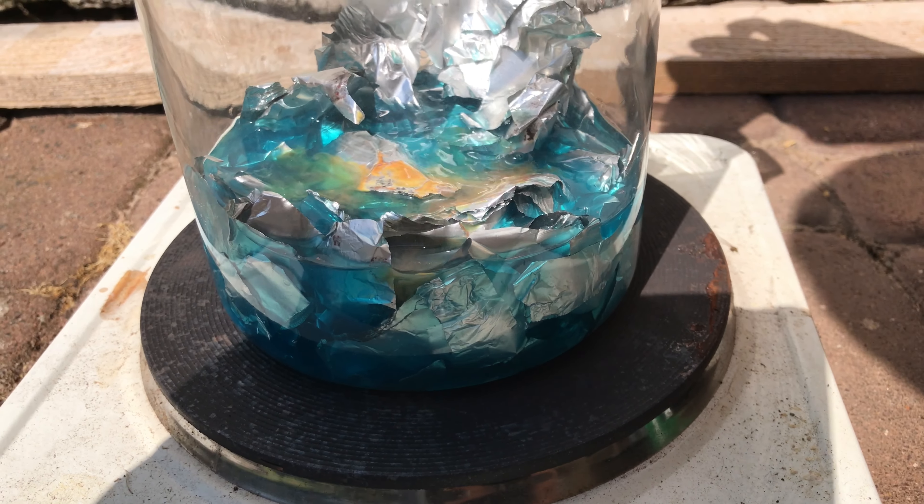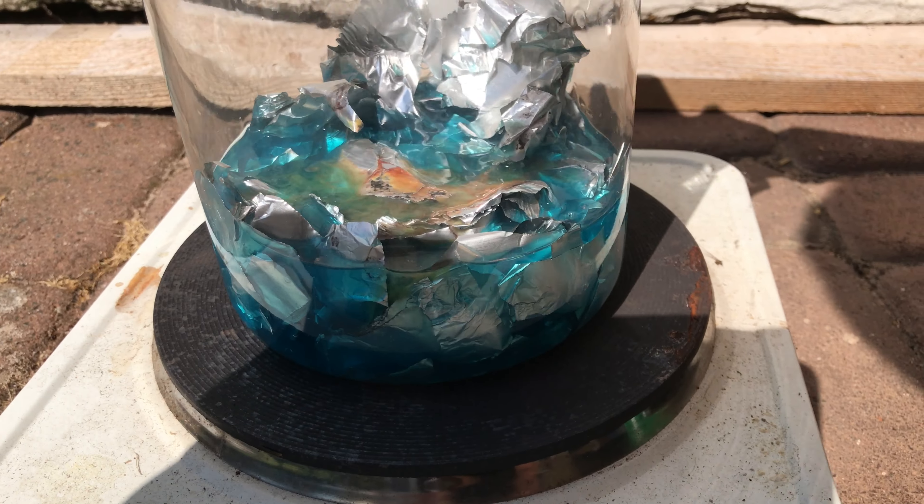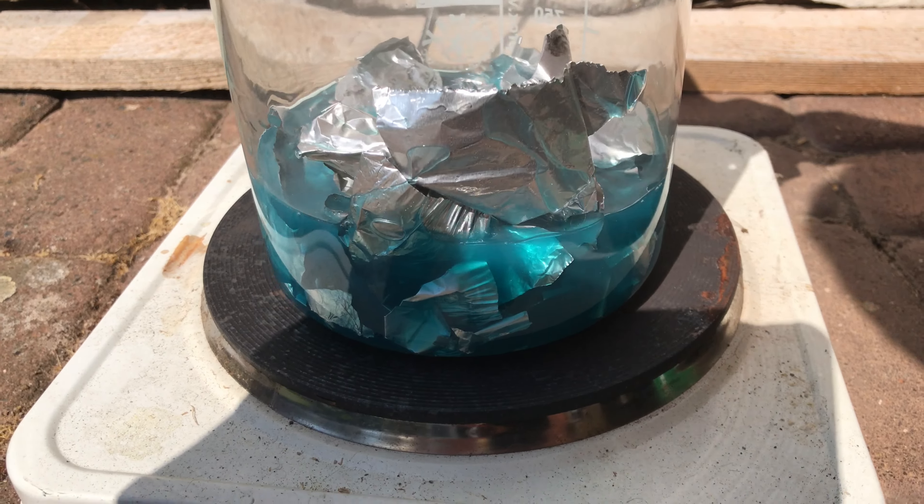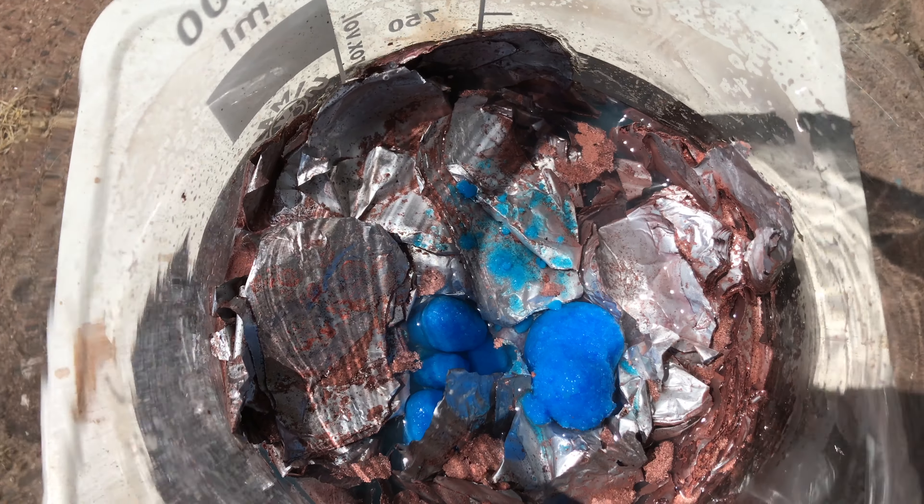It took a long time, but after about an hour all of that copper colour disappeared and we were left with some fine copper powder floating on top of the solution. It didn't look like much, but I ended up adding even more copper sulfate and letting it stand for even longer.